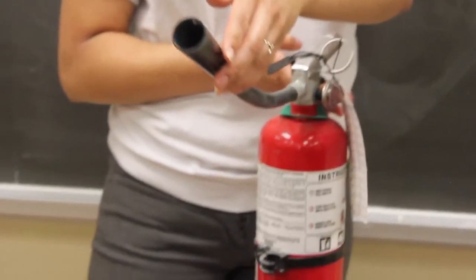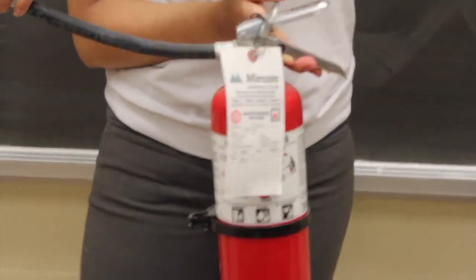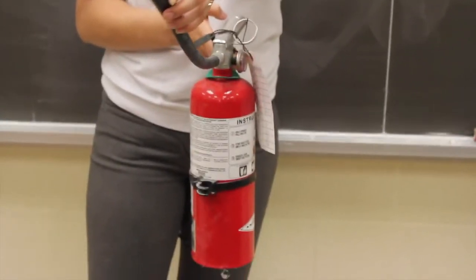To use a fire extinguisher, you must pull the pin, aim the tip towards the base of the fire, squeeze the trigger, then sweep from side to side to extinguish the flame. A mnemonic to remember this is PASS.